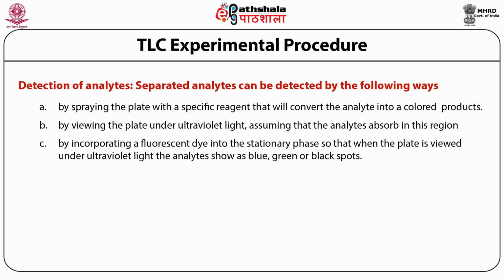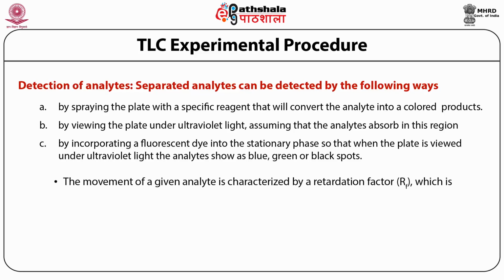The one in sky blue depicts the solvent system. Once the plate is placed in this glass chamber, the solvent system will start moving up the TLC plate due to capillary action. You can then measure the retardation factor, which is basically a method by which you can calculate the movement of a given analyte on a TLC plate.